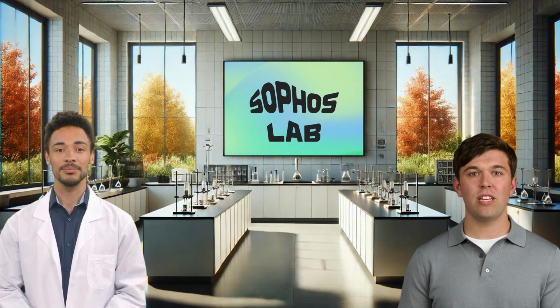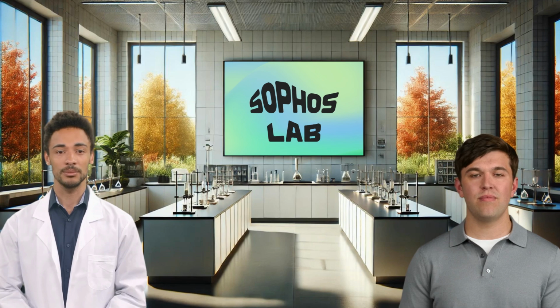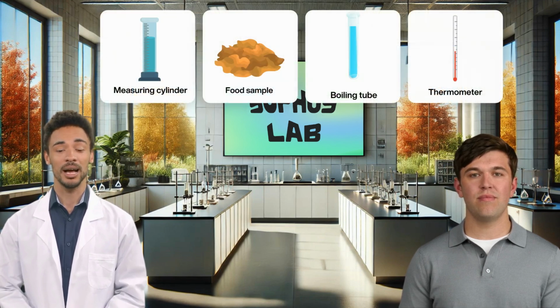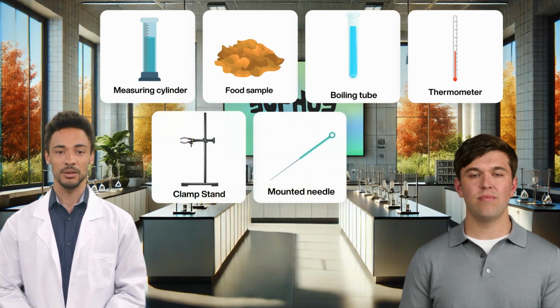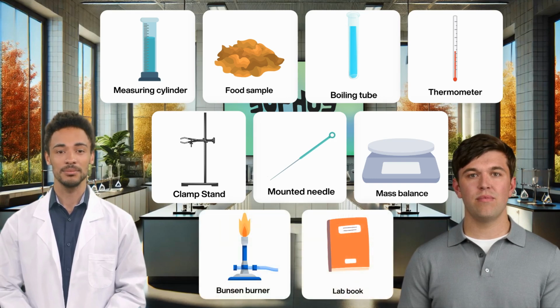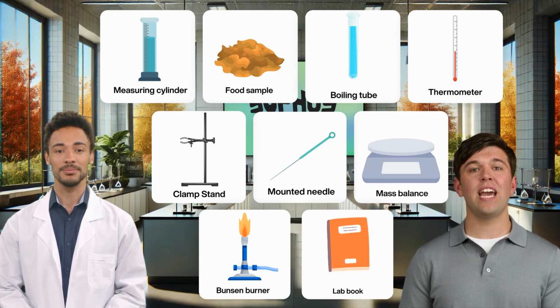Let's start by gathering our materials. Sam, what do we need? So for this practical, we need a measuring cylinder, food samples, a boiling tube, a thermometer, a clamp stand, a mounted needle, a mass balance, a Bunsen burner, and a lab book. Now, let's dive in and discover the science behind measuring the energy in the foods we eat.